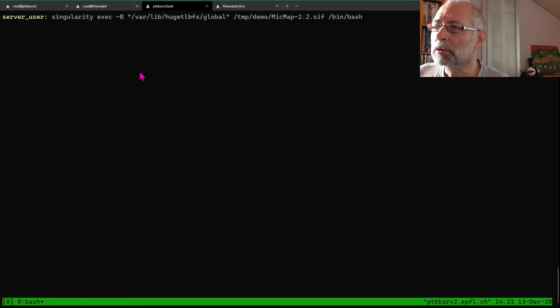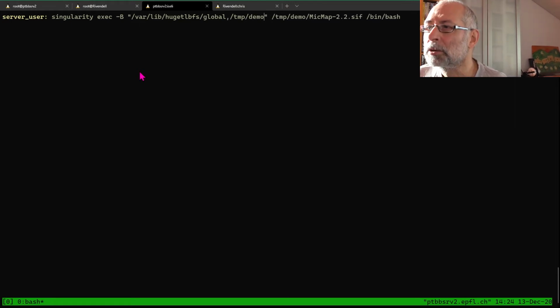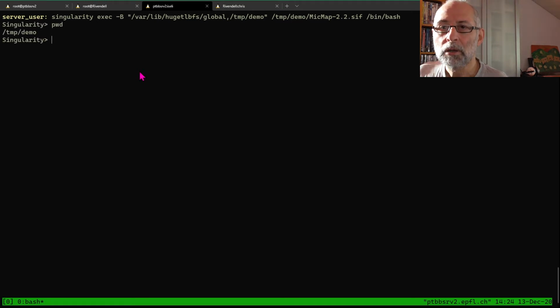Launch it since I want to use my TMP demo directory. Let's just add it here as well. Okay, so we are here.